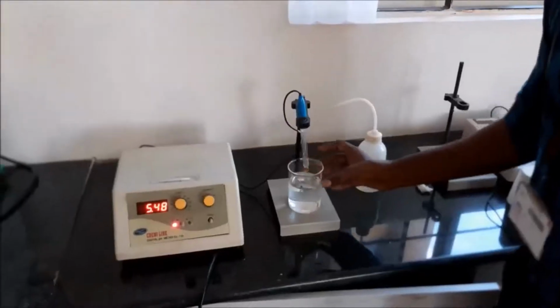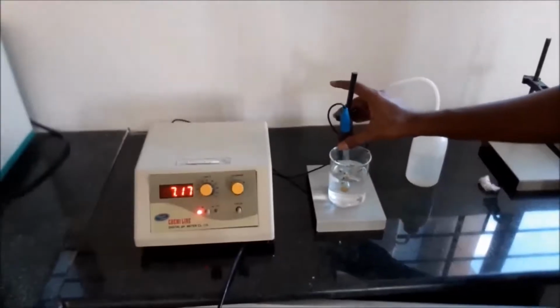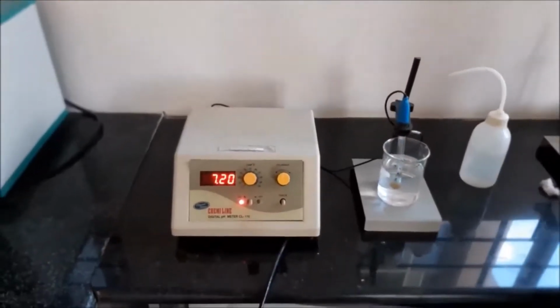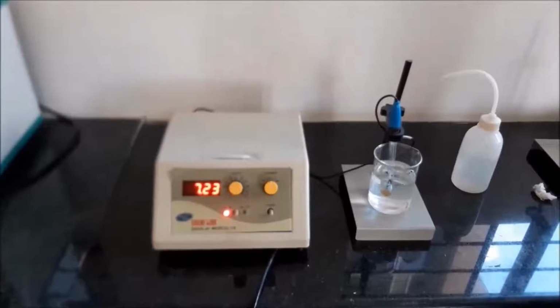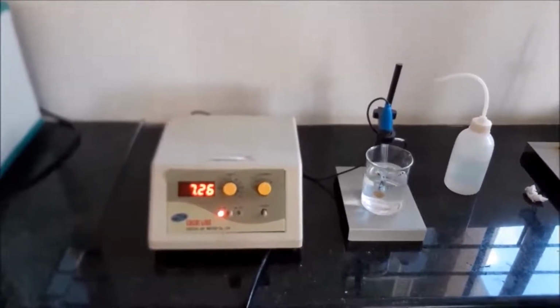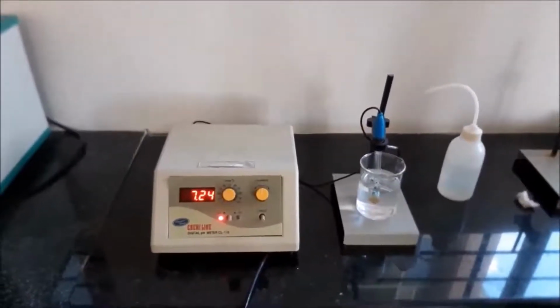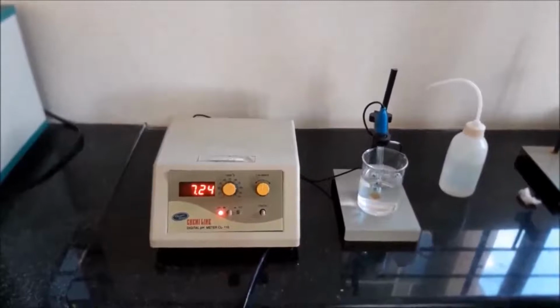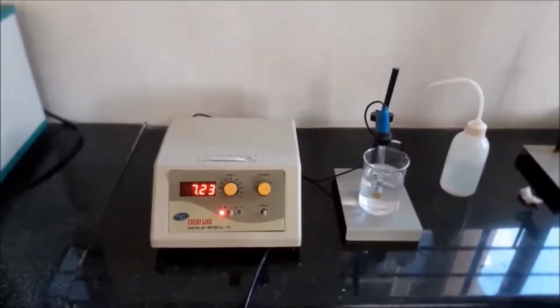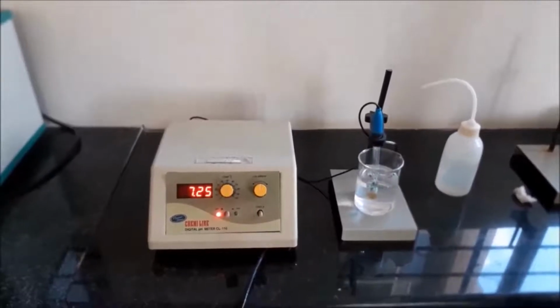The tap water is taken in a beaker and the electrode is immersed, and the pH value of the tap water is noted from the pH meter. A couple of seconds is needed to be waited, and then the reading is to be noted. The reading is 7.24 approximately.